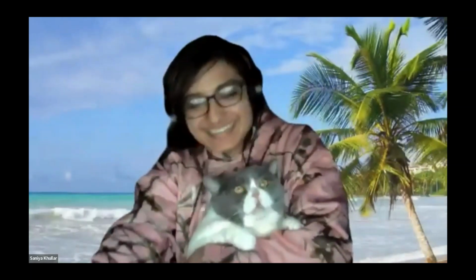Thank you guys. And again, I have other videos talking about how to make a sequence logo online from a set of motif occurrences. There are so many tools out there. I hope that this will help you guys.